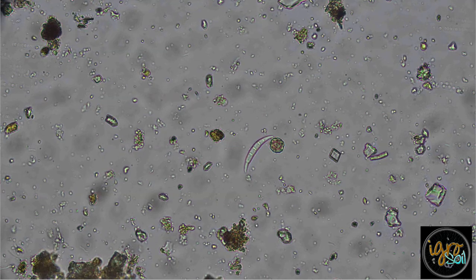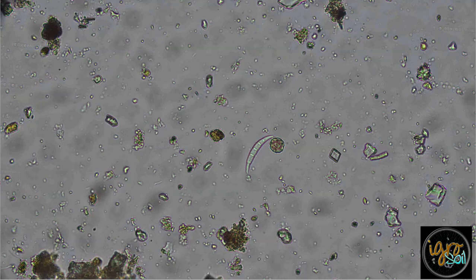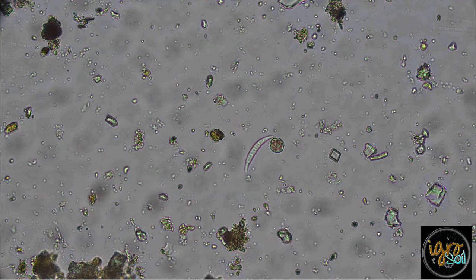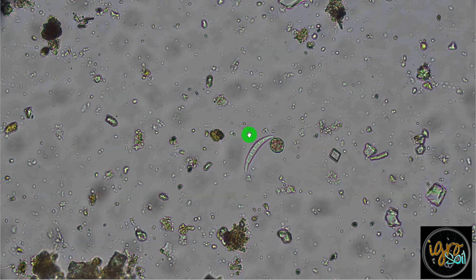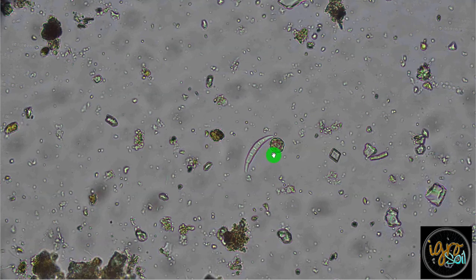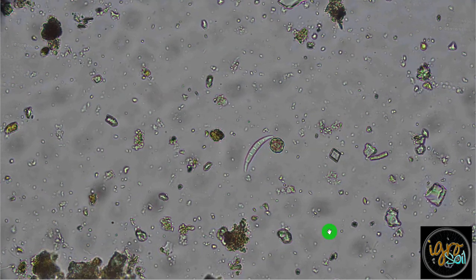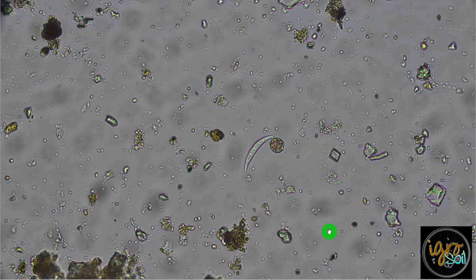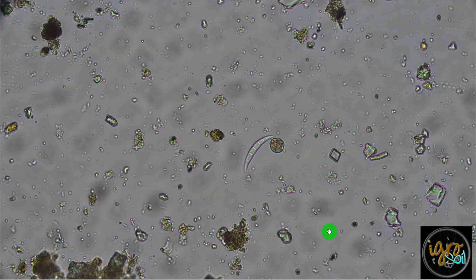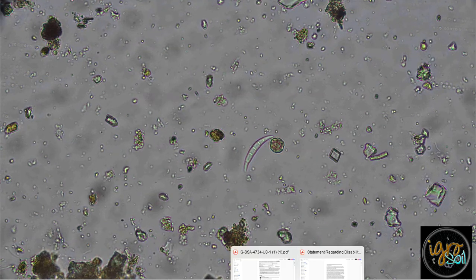All right, Oscar. So here's your soil sample. This is the third slide that I've used, and this is the third time I find it in a third slide. What I'm looking at here is called Fusarium solani, I believe, close enough. It's a pathogen in your soil. This is not the first time I see it, specifically on fruit trees out here on the west coast, Florida. And I've actually pulled up my notes.